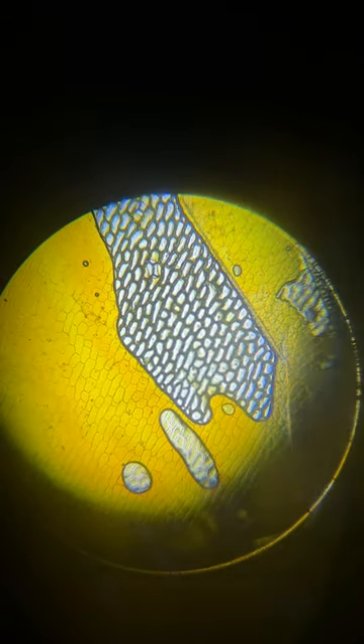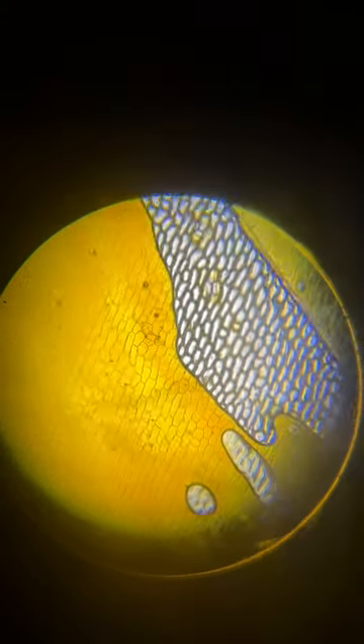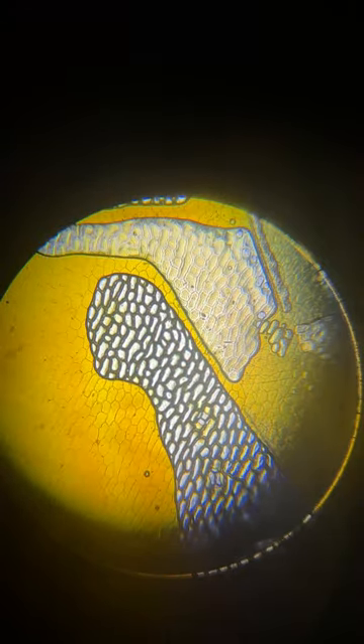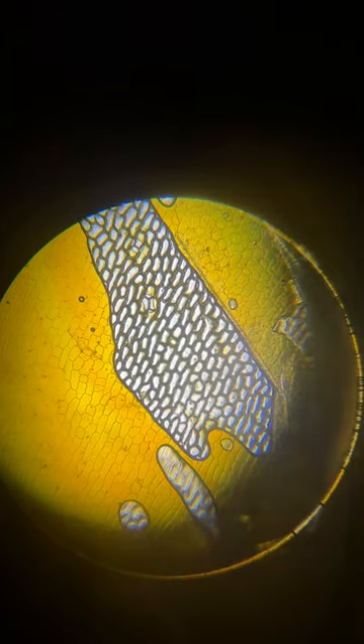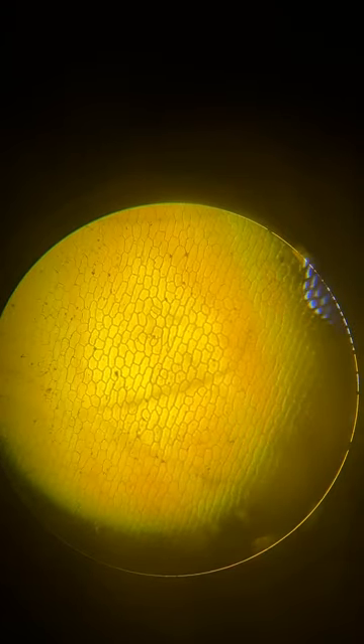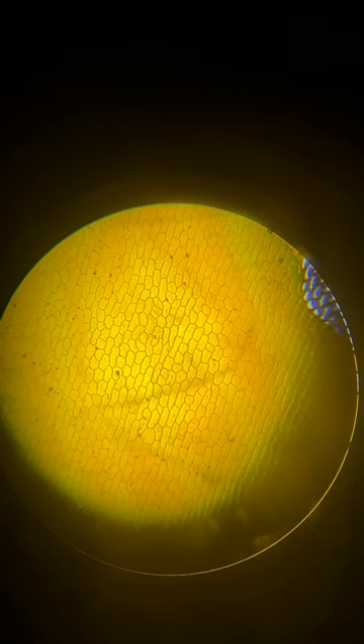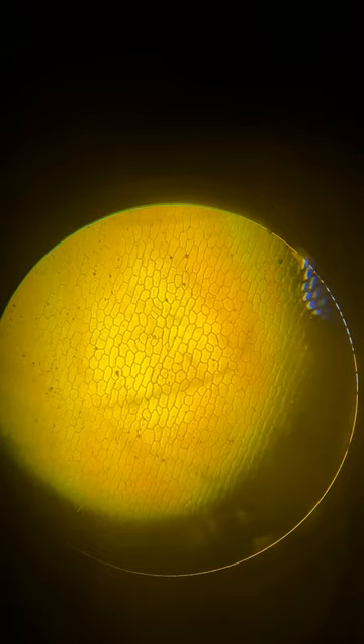These white parts here — again, that's just where iodine did not go into the cells. It's nothing spectacular; you can still sketch that. But I would stick with a part like right here. You can even see the nucleus in some of those cells — the little dots. I'm going to go to yellow and see if I can point out the nucleus here.